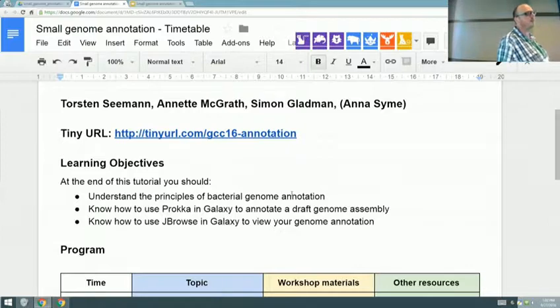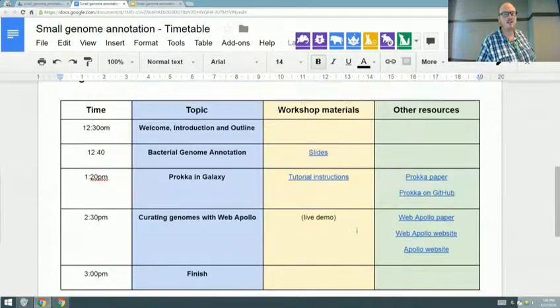It rearranges the order so it's in the correct format for submission to GenBank and has the right file extension. And also for completion's sake, the folder it creates is a bundle you can give. Yeah, I wish it was that easy. I noticed the naming convention is the same as GenBank. Yeah. So, all right, you've got the URL.